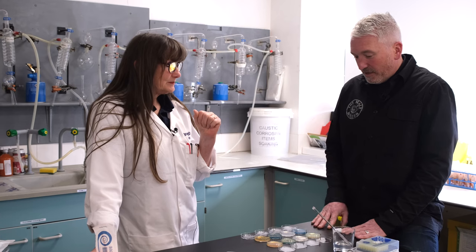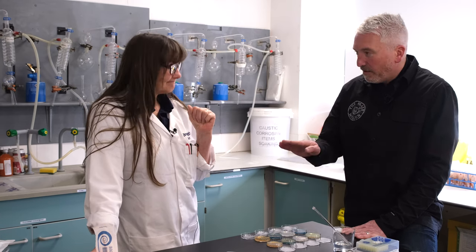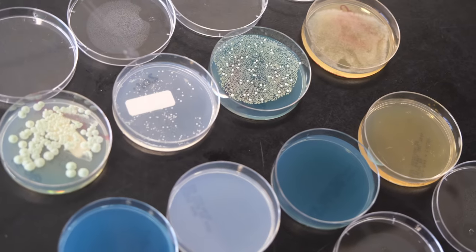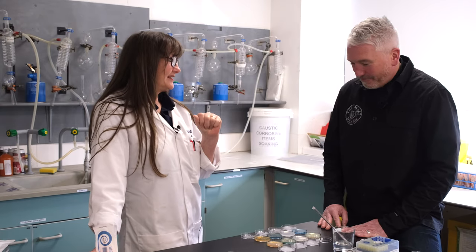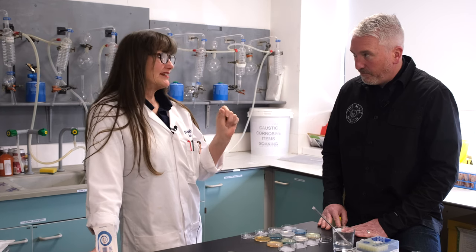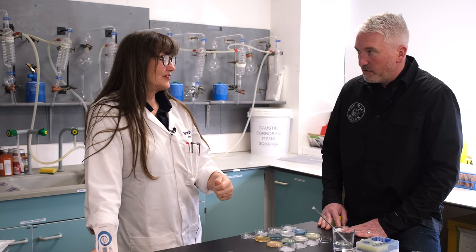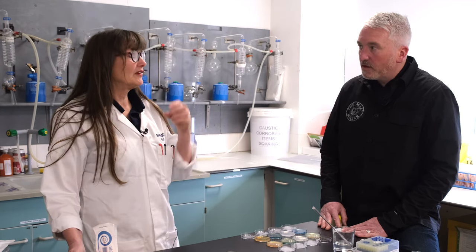So the takeaway is: after three to five days, we want to see absolutely nothing growing - that equals clean. If we see anything growing, we've got contaminants and an issue. Always consider how the sample was taken - was it a representative sample from the vessel? If it was taken from a dirty tap, you could get the same sort of contamination result, so be very careful how you take the sample.